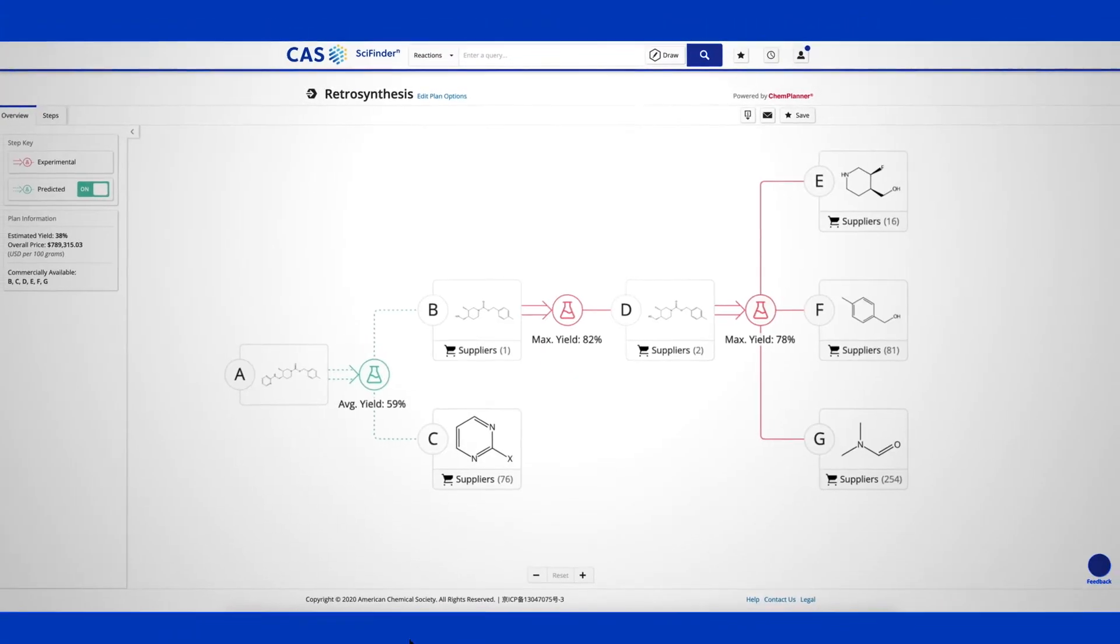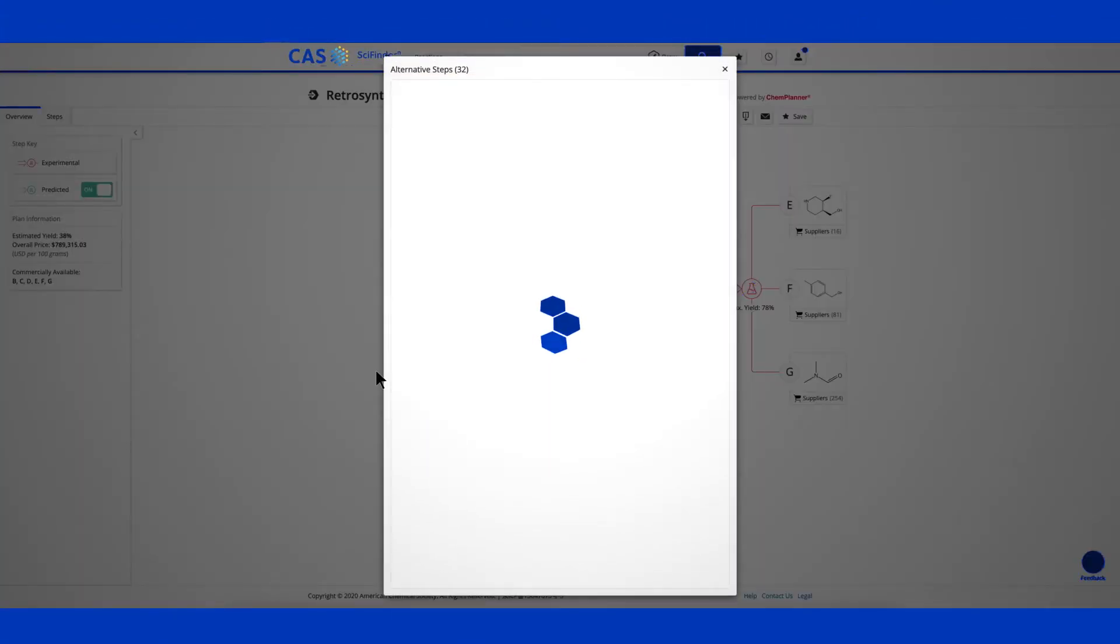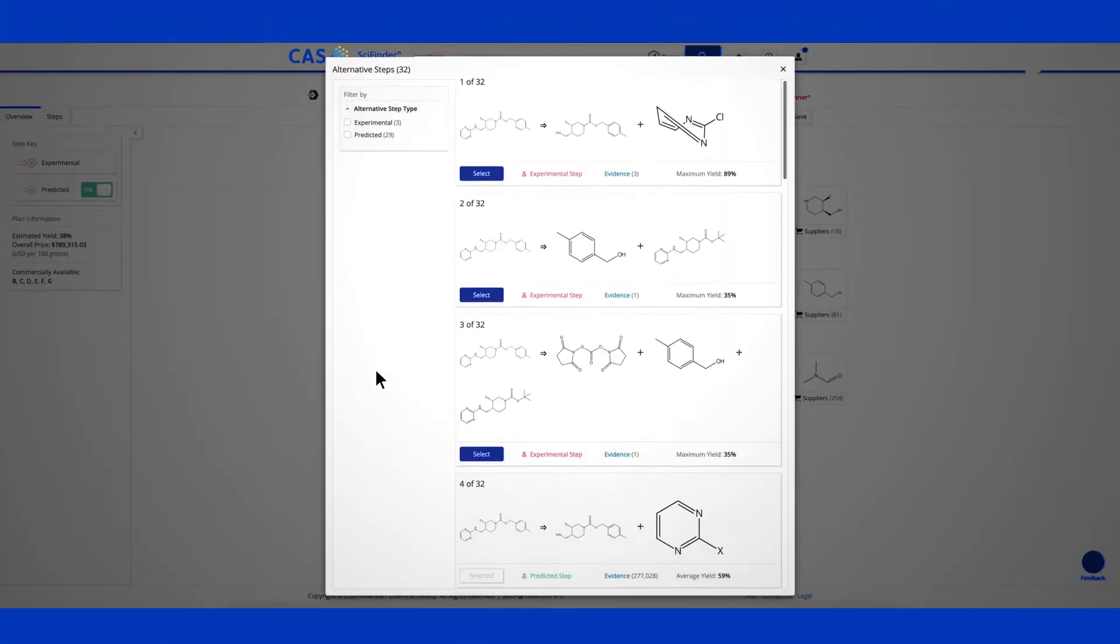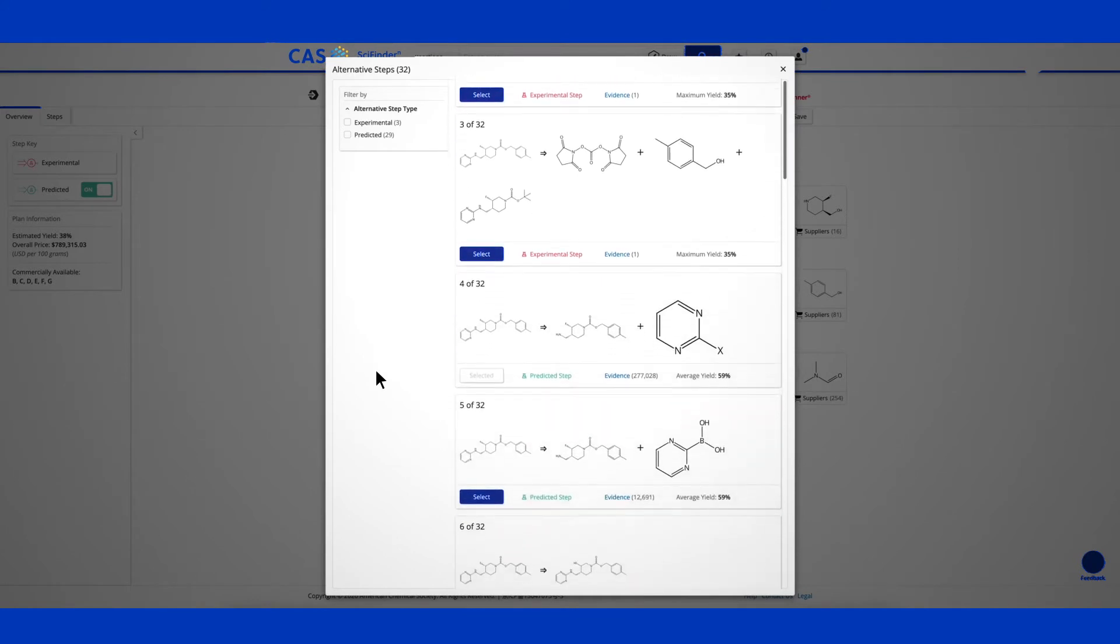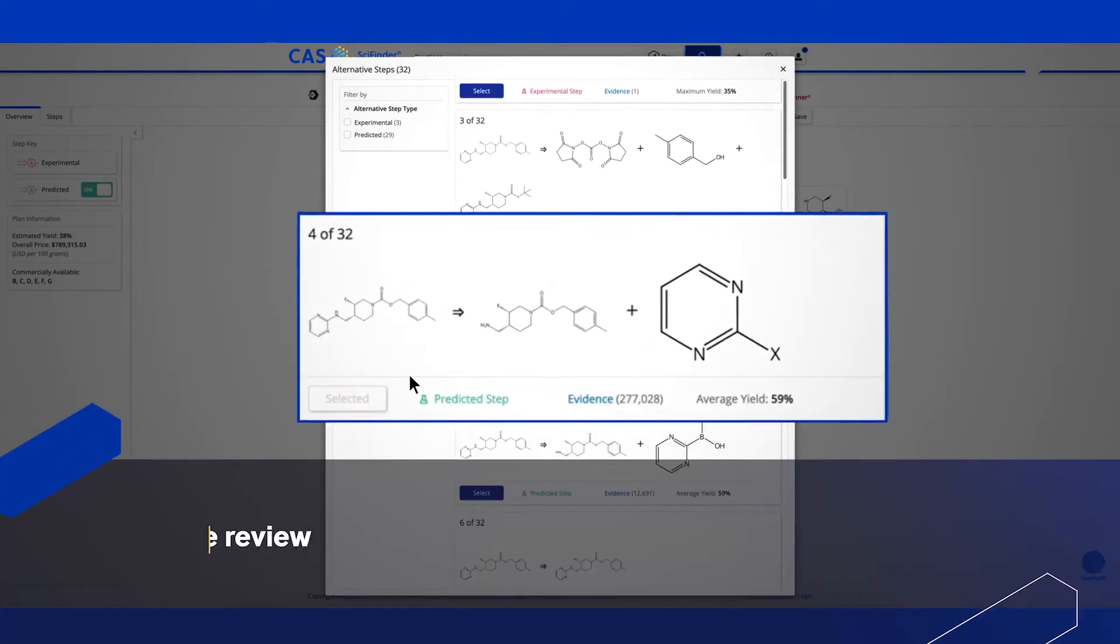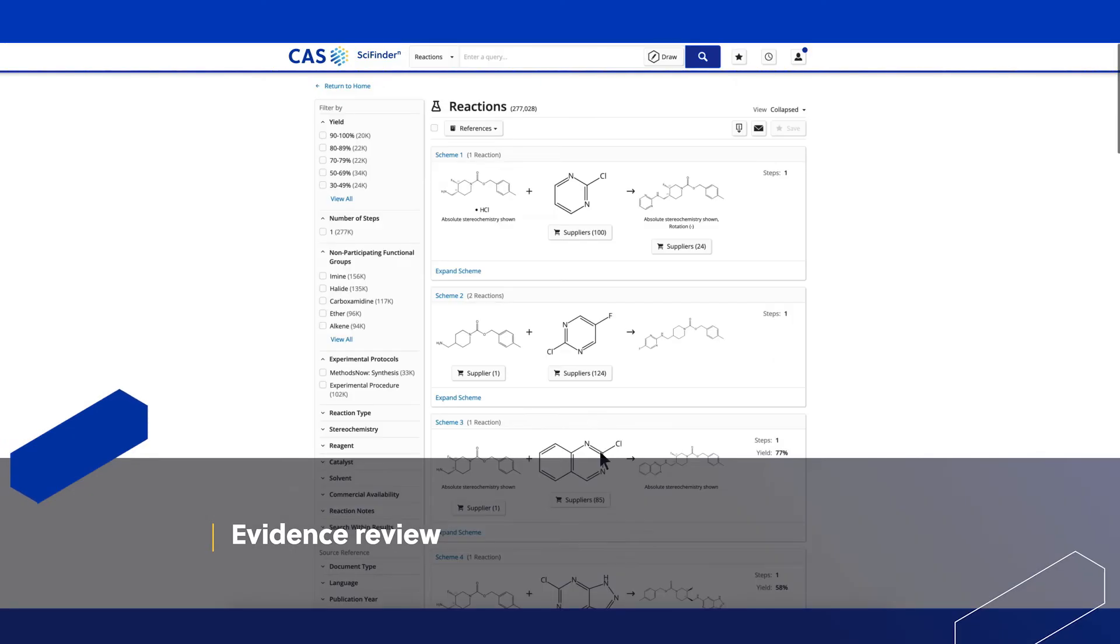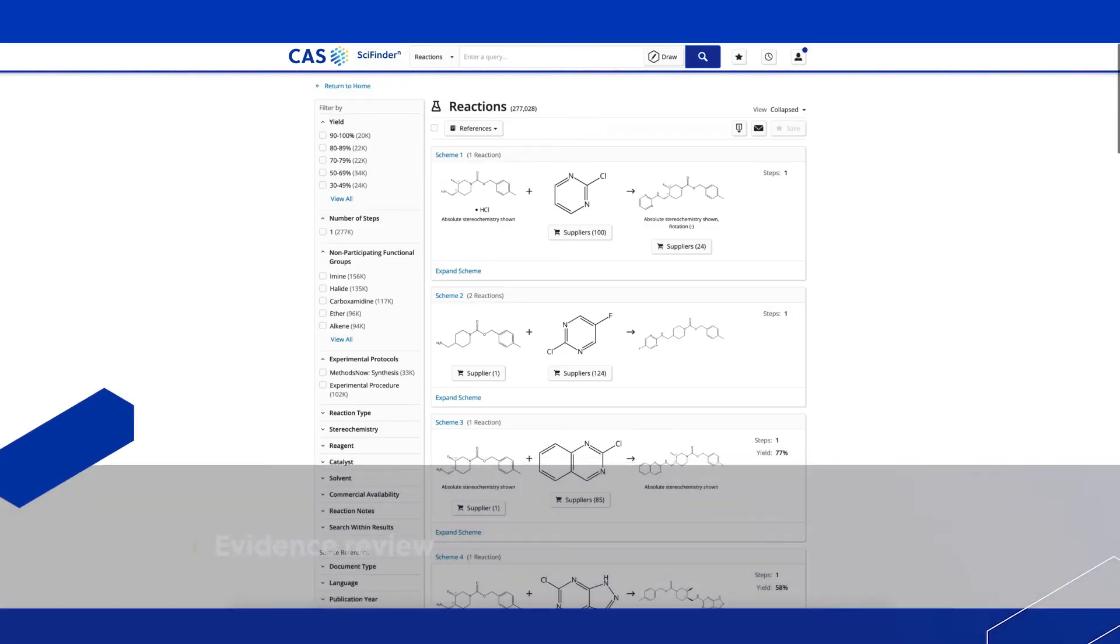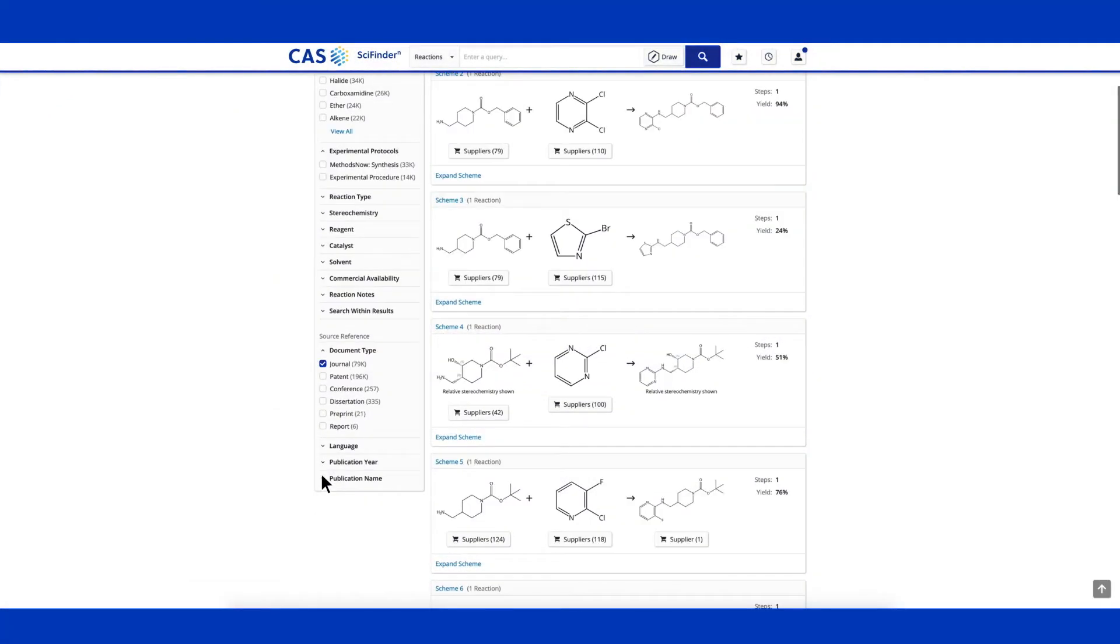Alternative predicted reaction steps can be evaluated and seamlessly incorporated into the plan. Predicted reaction steps are based on scientific evidence of similar reactions from the CAS comprehensive curated collection of synthetic research.